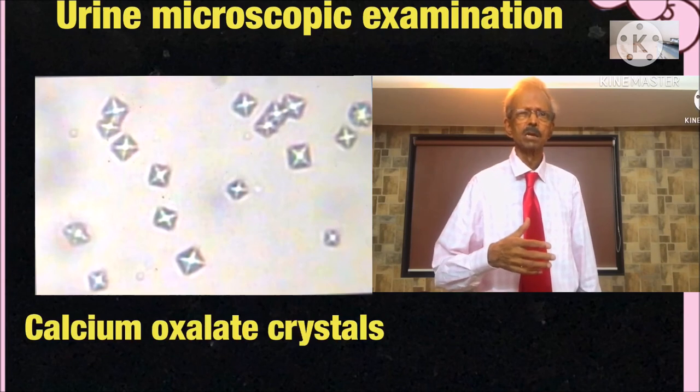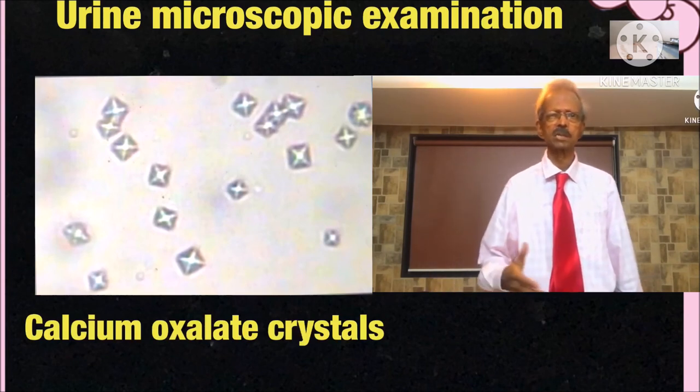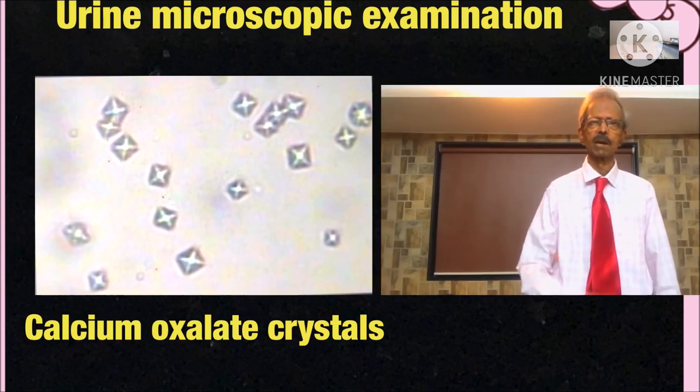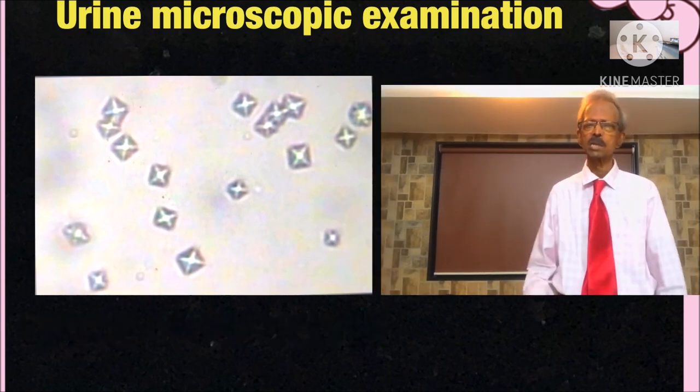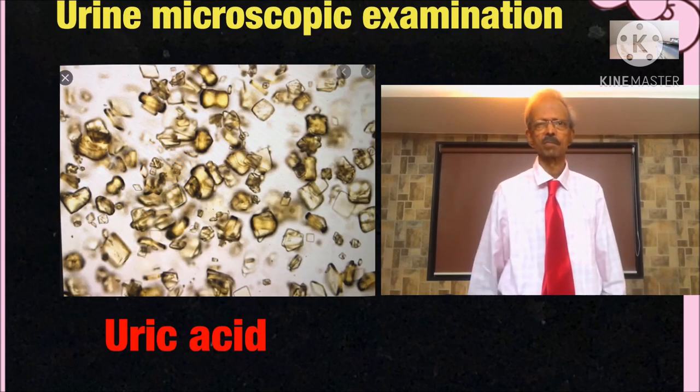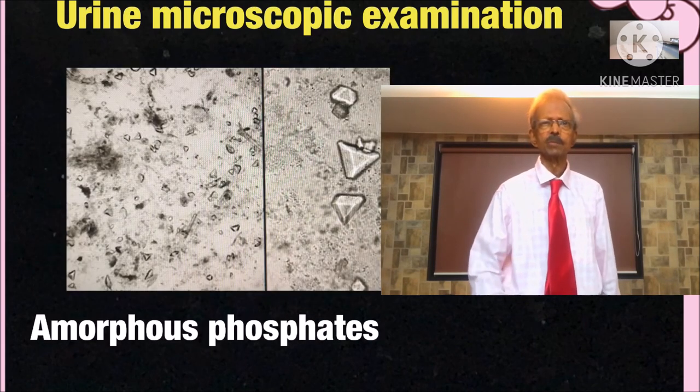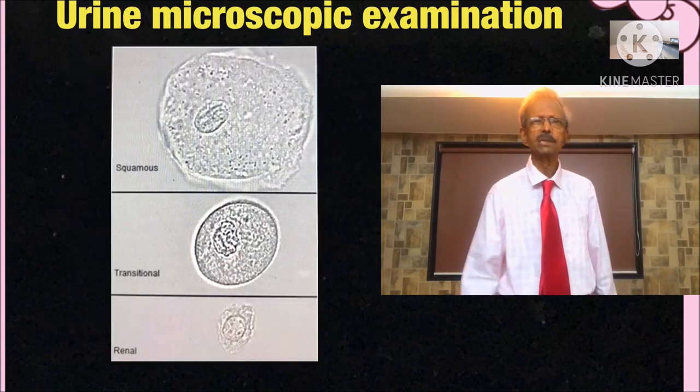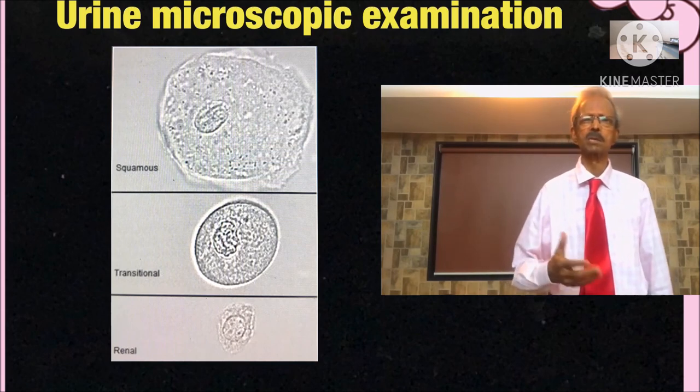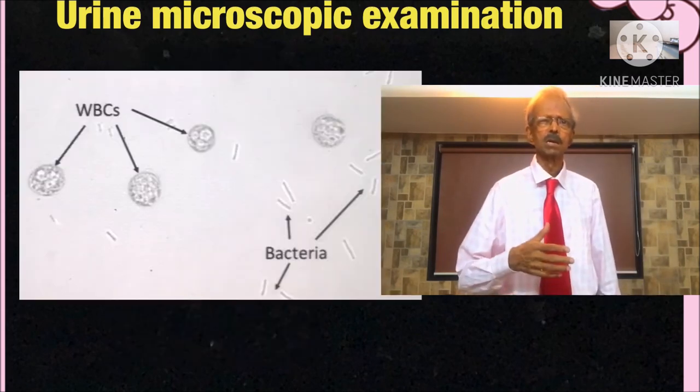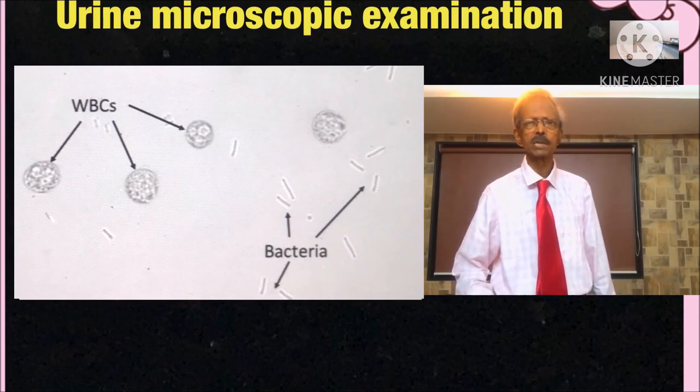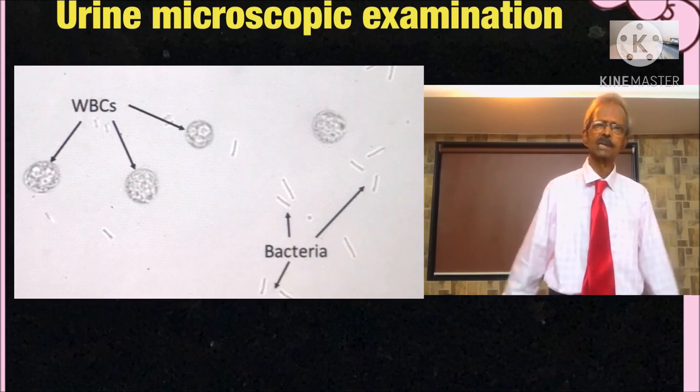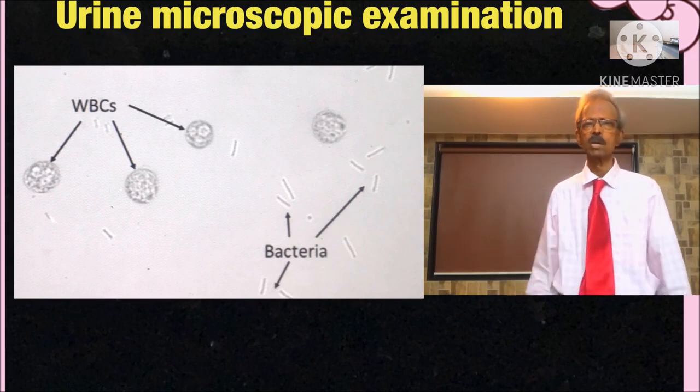Then in the case of renal calculus or calculi, you may see large number of these crystals: calcium oxalate, uric acid crystals and amorphous phosphates. Learn to differentiate squamous epithelial cells and transitional epithelial cells as shown on the left hand side. And bacteria may also be seen in urinary tract infection or if urine is stored at room temperature for very long period.